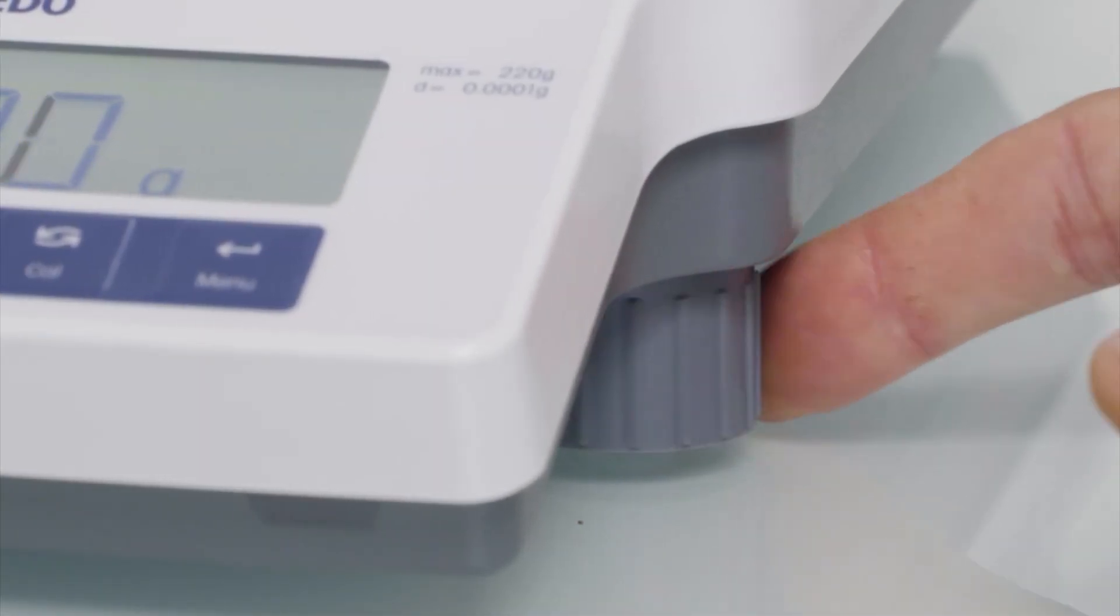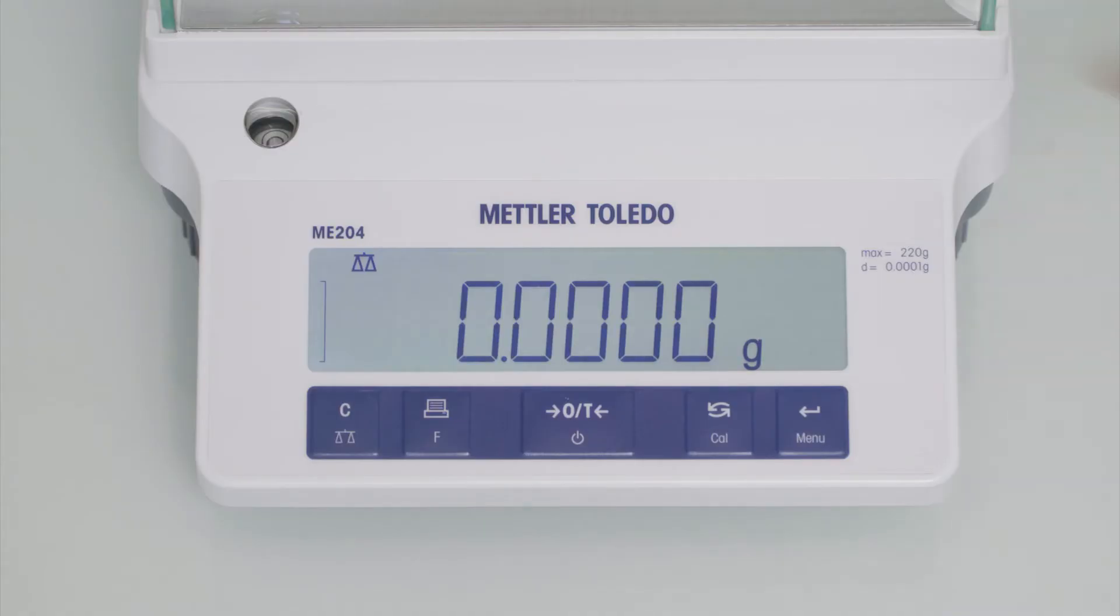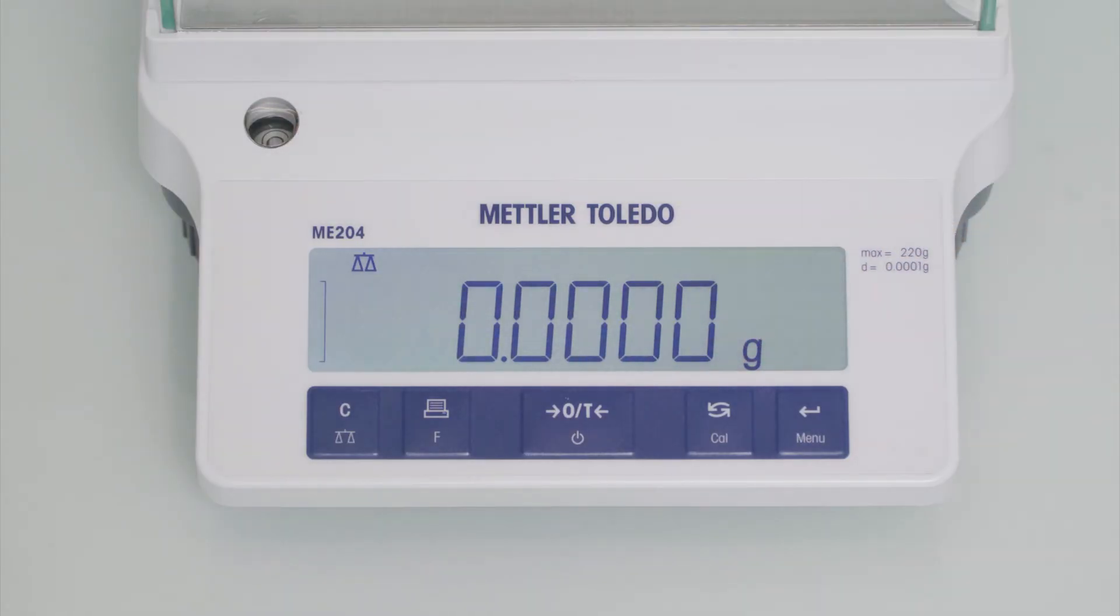Moreover, two large adjustable feet help you to level your balance quickly. The level indicator is at the front so it's easy to check and ensure your balance is working accurately.